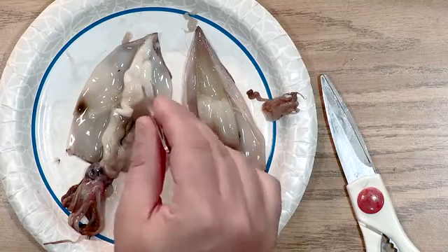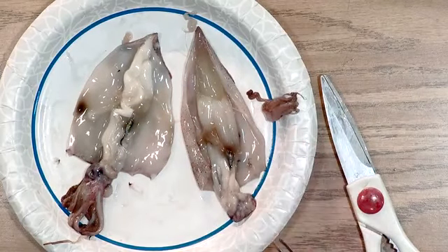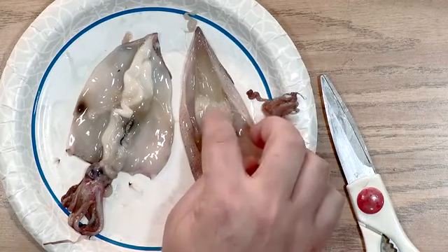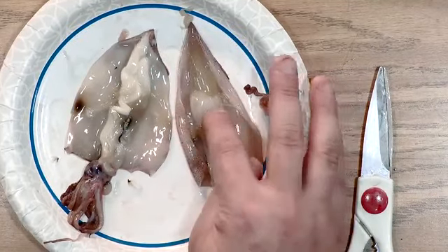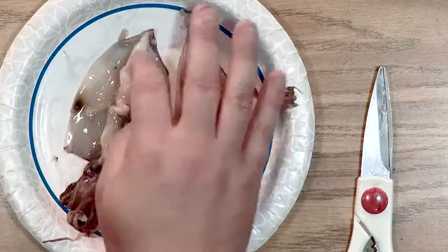Well, if you guessed that this was the male squid, you are correct, which leaves this to be the female squid. Notice it's got different organs here than we've got over here. And this is really something that you have to feel to understand. This has some structure or strength to it, where there's way more squishiness going on here.